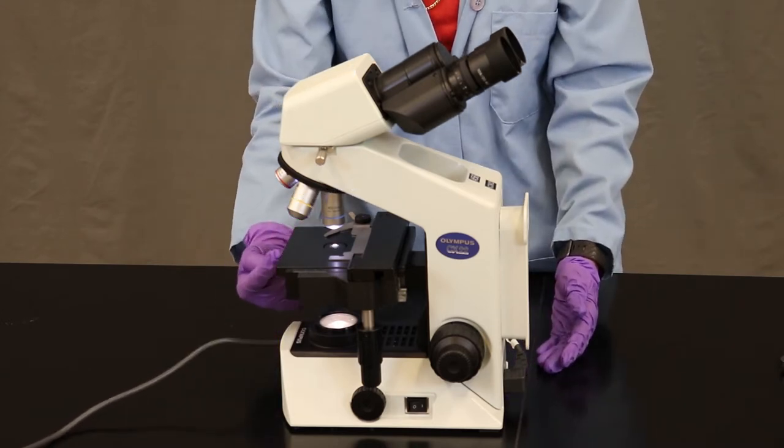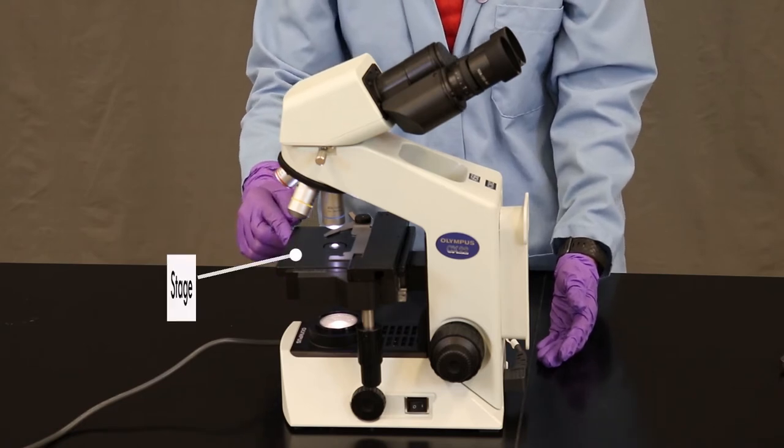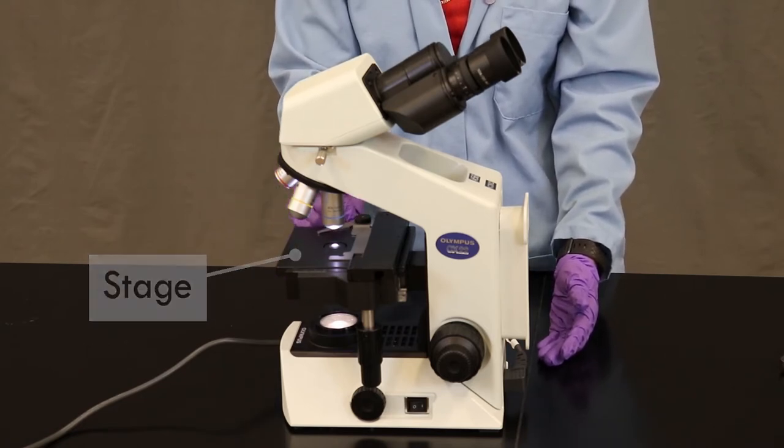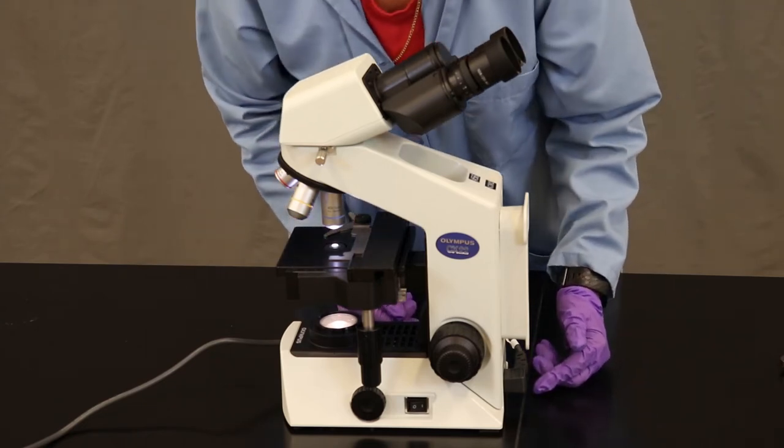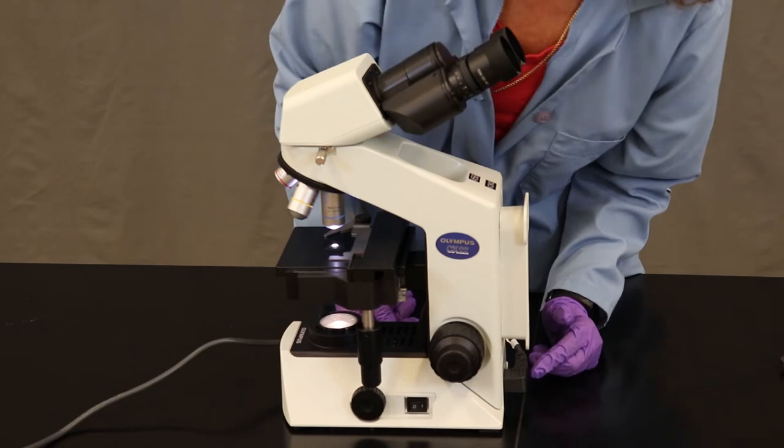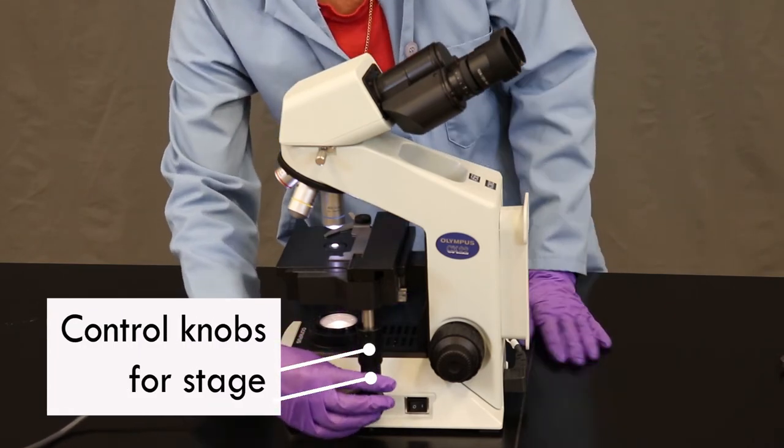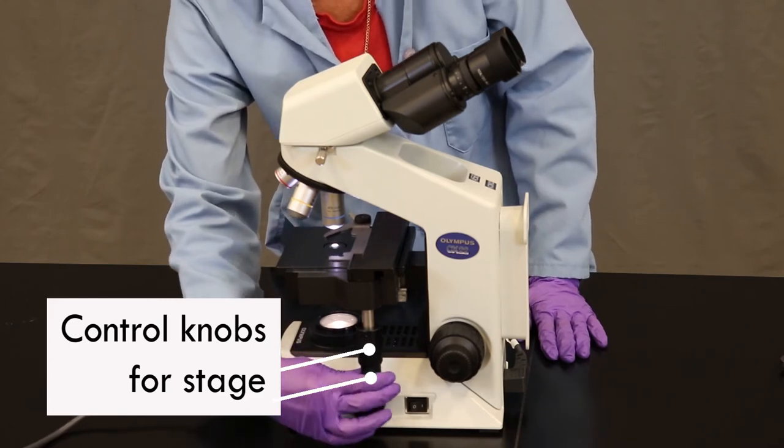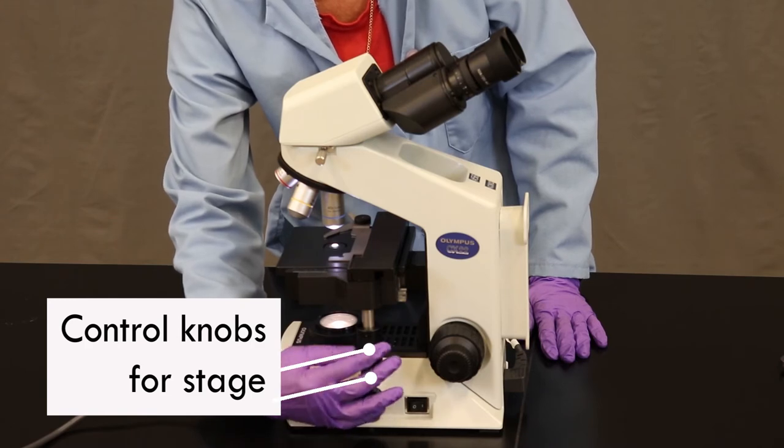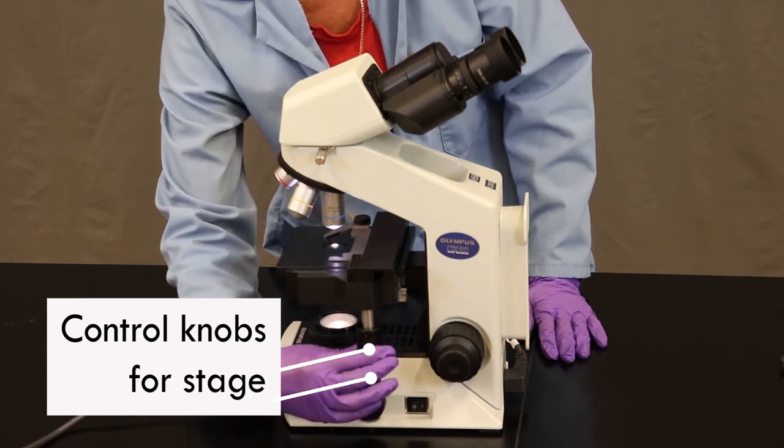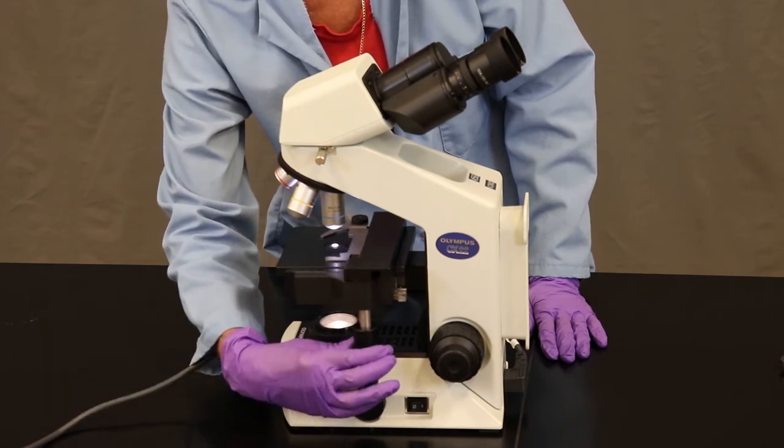This platform here is the stage. And it holds the slide in place. And you can move the slide around using these knobs. And these knobs go in two different directions. The bottom one goes left-right as you're looking through the microscope. And the top one goes back and forth towards and away from you when you're looking through the microscope.